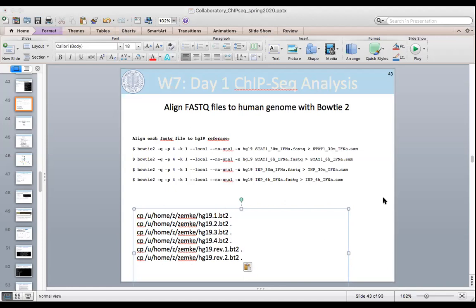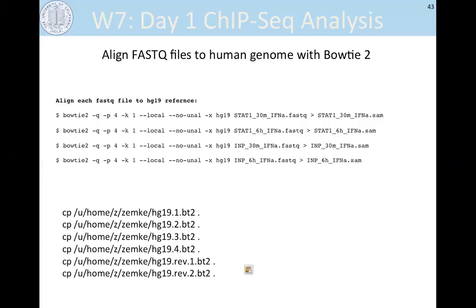All right, hopefully you can see this. There are these 6 files that you need. You'll just use the cp or copy command, from my folder, this is the file, to space period, which, as long as you're in the Flash Scratch folder, will copy to your Flash Scratch.